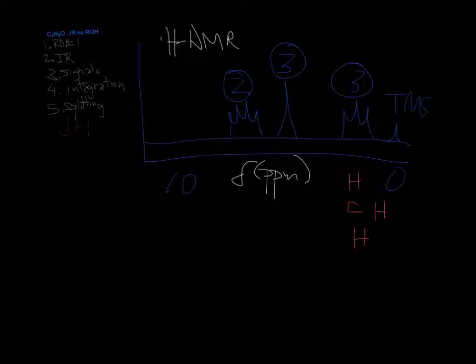They're all identical. You could try to tinker around with it, but many times, not always, when you see a peak that integrates to 3, that lets you know that chances are, most likely, it's going to be some type of methyl group. Not, like I said, not always. I'm sure there are times that you can have 3 identical hydrogens and something else, which I'm sure we can find one, but it's much more difficult. Okay, so that's what that looks like. It's a methyl group. We just don't know what it's connected to. So I'm going to draw it like that.